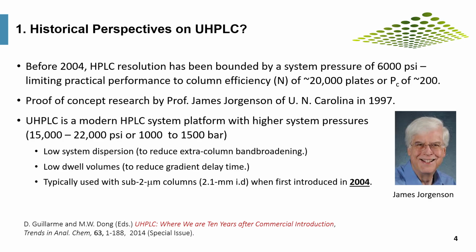Here is a slide describing historical perspective on UHPLC. Before 2004, HPLC resolution had been bounded by system pressure of about 6,000 psi, thereby limiting the practical performance of column efficiency to about 20,000 plates, or a peak capacity of about 200.